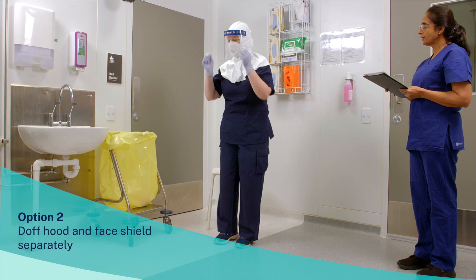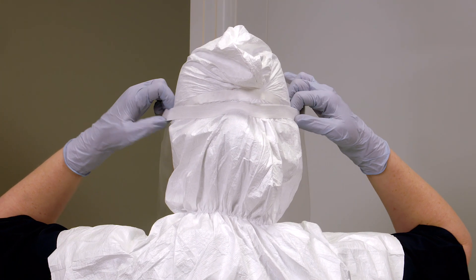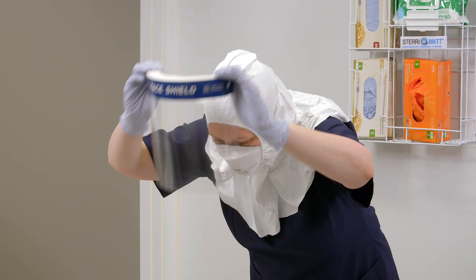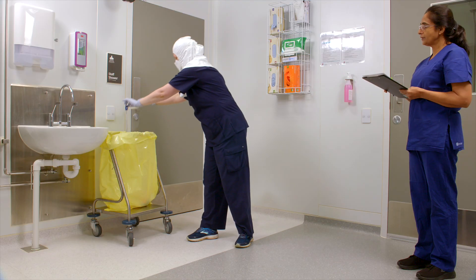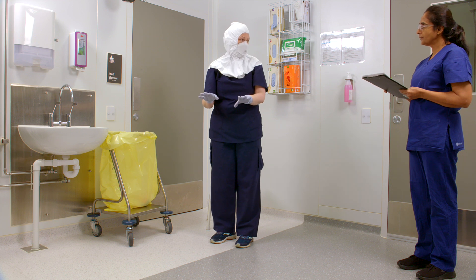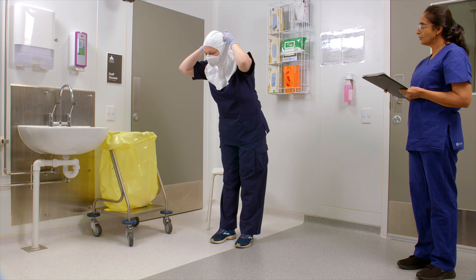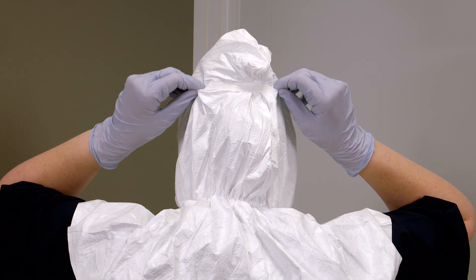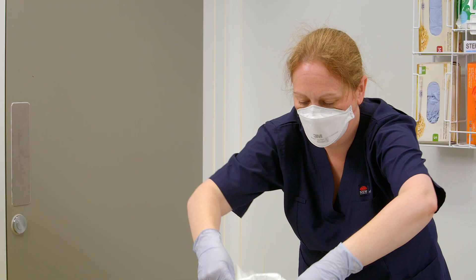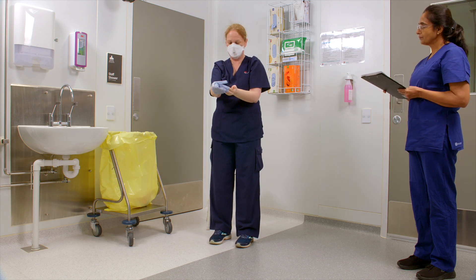Option 2: doff the hood and face shield separately. Doff the face shield by grasping the elastic strap, bend at the waist, tilt head downwards, and pull forward in a downward motion. Discard into the clinical waste bin. Now loosen tape if applied. Grasp back of the hood, bend at the waist, tilt head downwards, and pull forward in a downward motion removing the hood. Doff gloves and perform hand hygiene.